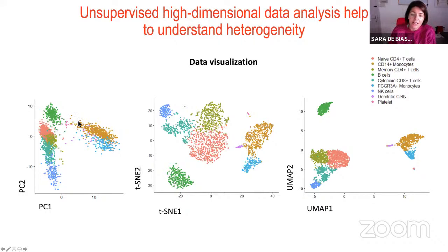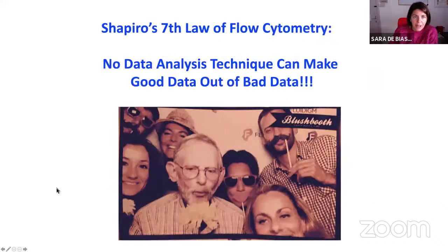And you can see here that on the basis of the graph you are looking at, you will see the same results. So different kinds of populations clusterize in different parts of the plot. And you can see here, for example, with tSNE or with UMAP, that the populations are really separated from each other. So by selecting a computational tool, you can analyze your data and visualize your data and see which kind of populations are represented in each data set.